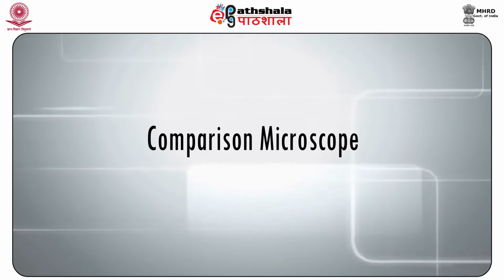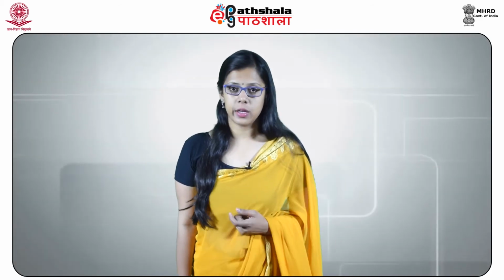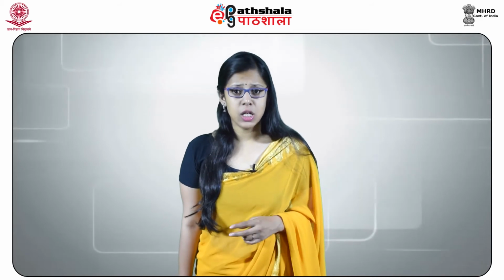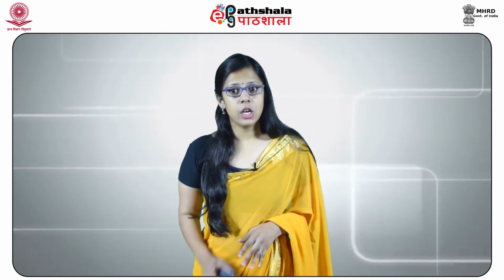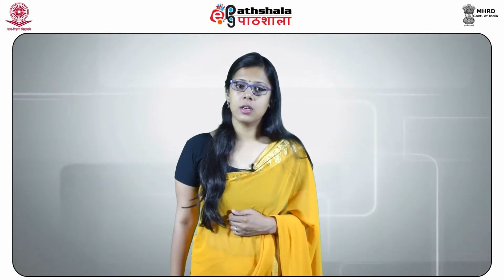Then we have the comparison microscope. A comparison microscope is a device used to analyze specimens side by side. It contains two microscopes linked by an optical bridge, which results in a divided view window, enabling two separate objects to be viewed simultaneously. A comparison microscope is essentially two microscopes linked by an optical bridge that permits the observer to view two objects concurrently with the same grade of magnification. This instrument can have a monocular or binocular eyepiece.